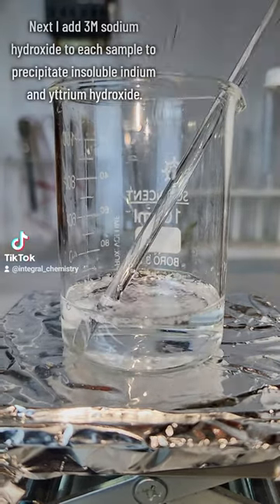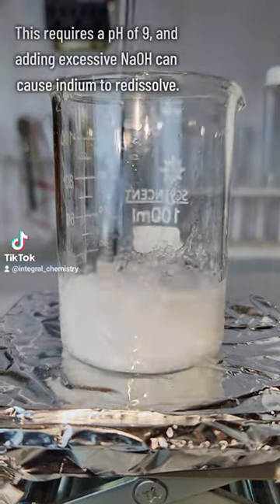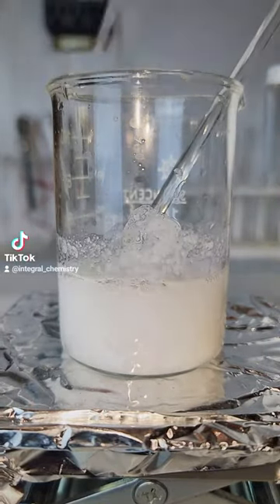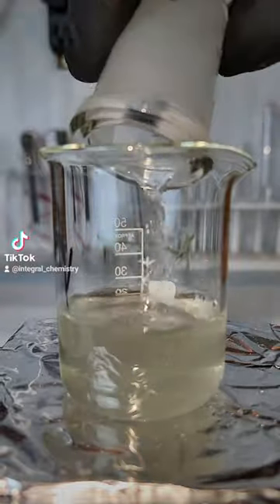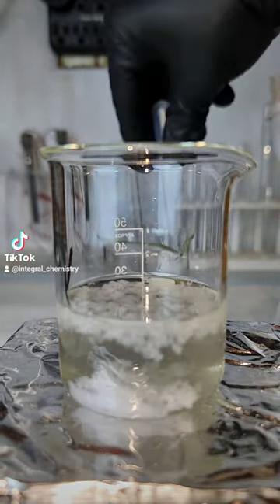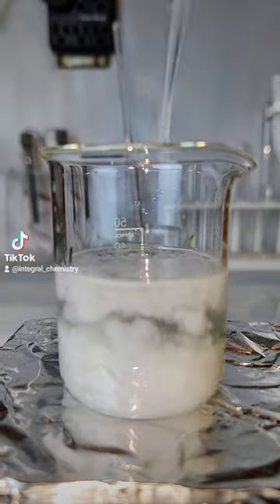I'm doing the indium first while I wait for the yttrium to finish dissolving, but they both look pretty much identical. I also want to note that you don't really need to be that careful when you make the yttrium hydroxide, but when you make the indium hydroxide, it's really important that you don't exceed a pH of 9. This is because indium hydroxide will actually re-dissolve into an indium sodium double salt in excessively alkaline environments, which you really don't want.